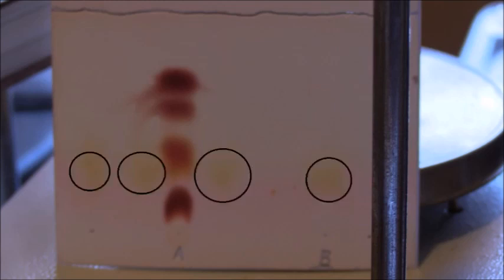I just want to state up front that the results of this test were very disappointing. Okay, so here you can see the very dark spots on the left, which are the spots left by the reference solution. After doing this test three separate times, I was only able to get these faint yellow spots for my test solution. And as you can see, the faint yellow spots are all over the place. I was just trying to get some kind of result that I can report.